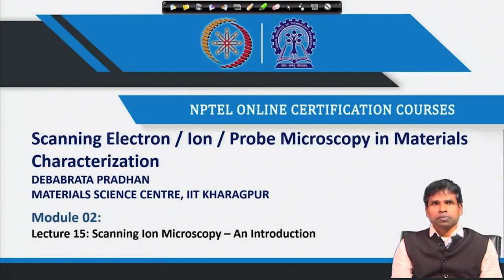Welcome back to our course on scanning electron ion probe microscopy in material characterization. In the last several lectures, we have focused on scanning electron microscopy, where the electron beam was used to obtain the images or surface topology of the specimen. In addition to that, scanning electron microscopy is also being utilized for several other purposes that we have briefly discussed.